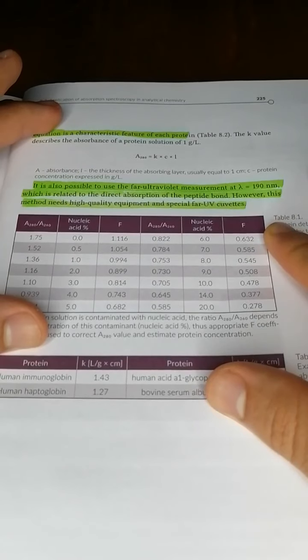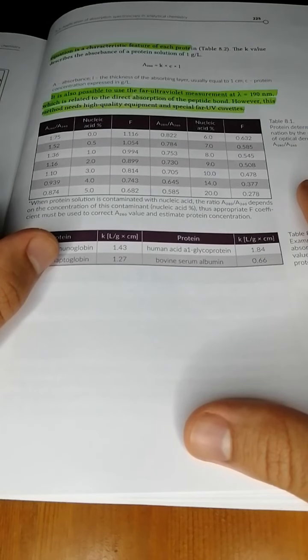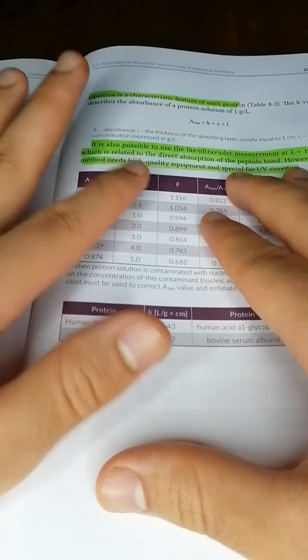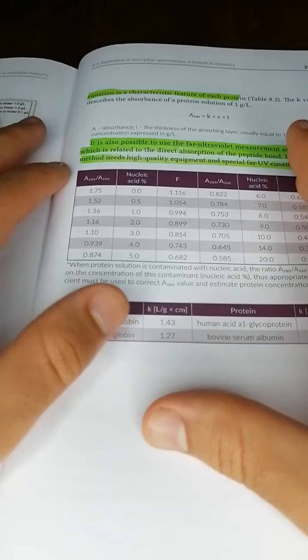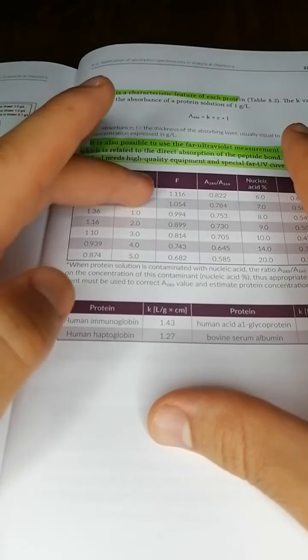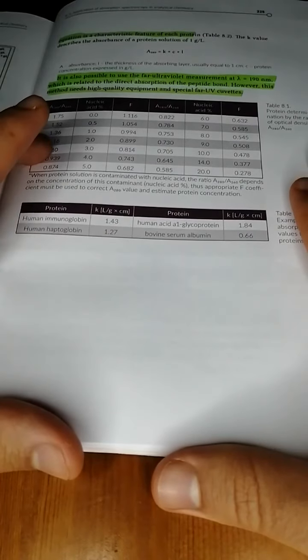Here is a table of factors of absorbance at 280 compared to 260 nanometers wavelength. It tells you what percentage of nucleic acid you have. Here is the ratio, and you'll see that each ratio corresponds to a certain concentration of nucleic acids. Then you can use these two to figure out the concentration of the proteins.